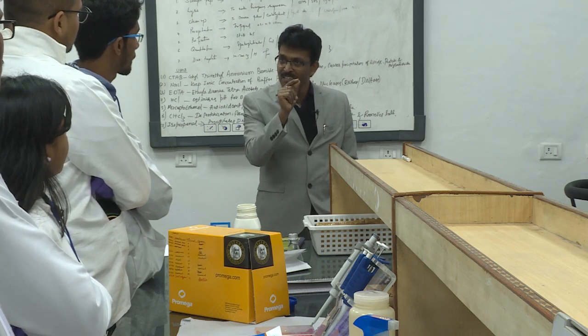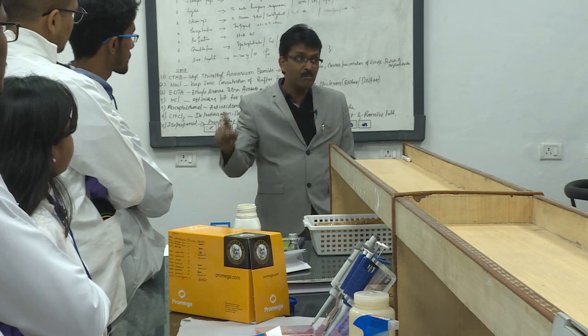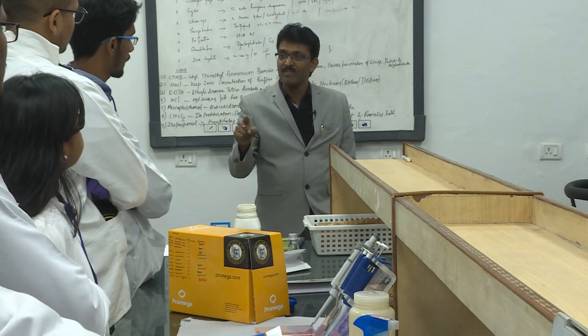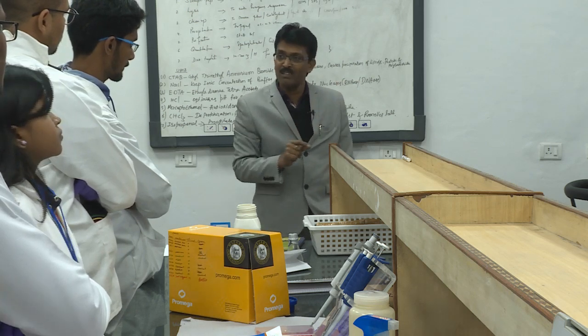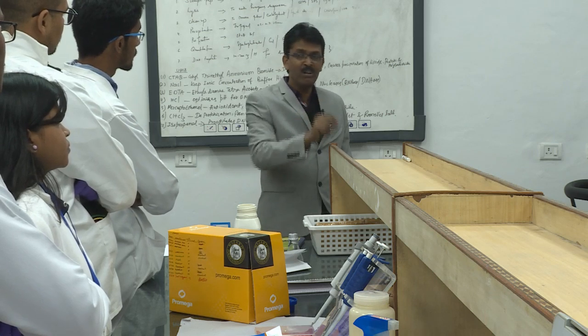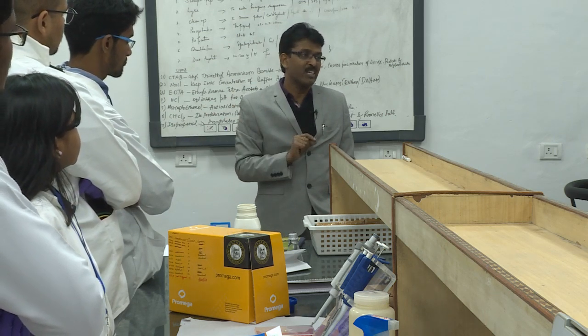The single colony is multiplied on the second plate. Ensure that the second plate is free from any other contaminants. And from that plate, you take one share for preservation, and make another one for identification by Biolog or FAME or 16S. That should be the strategy.